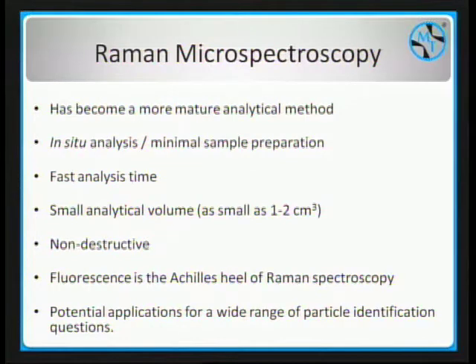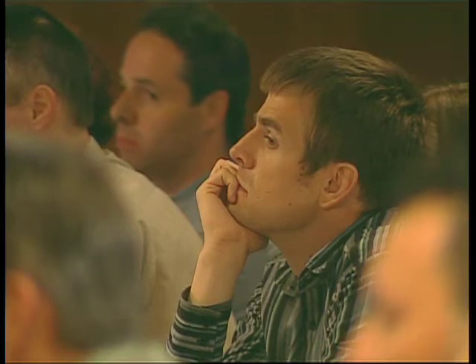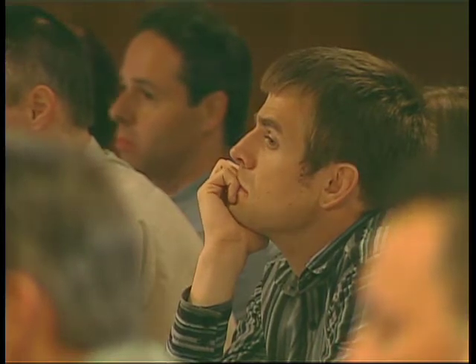It's non-destructive, and people generally learn very quickly, as soon as they hear about Raman, that it's possible to burn samples. If you start with lower laser powers, which are adjustable in most Raman systems, and work your way up, you can mitigate a great deal of the burning and lighting samples on fire that you've probably heard about. Fluorescence is really the big problem, and I think it will always be a problem.